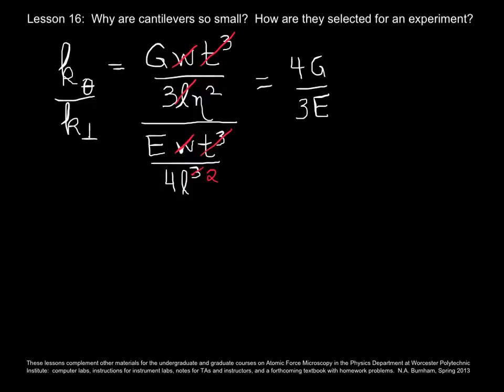That's controlled by the selection of materials, silicon or silicon nitride typically. And then we have the length over the tip height squared.